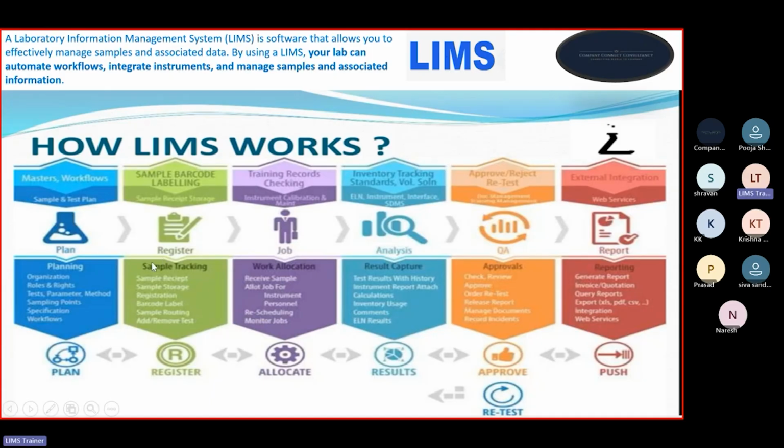Then comes the register phase. Here in the register phase, you will register a sample, like when you are receiving a sample. Then you will have the sample receipt, sample storage, sample registration, barcode label, sample routing, and add or remove test. Okay, so this is the register phase.